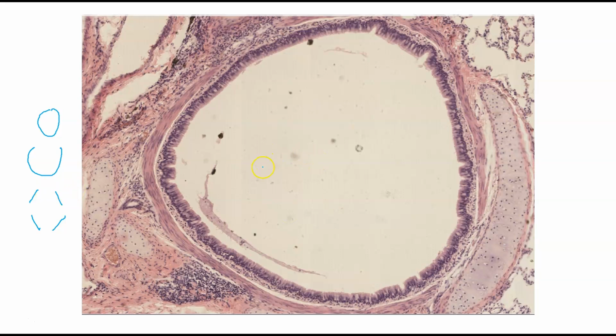And if you look at this picture, that is what is so hot about it. Around the bronchus here, we don't have a complete ring or a C. We've got these boop, boop, boop, kind of irregularly spaced cartilages. These are the irregular plates of cartilage that surround the bronchus. That's why it's so cool. Dude, you have no idea. I have yet to have found a picture that shows this awesome kind of irregularly spaced plates of cartilage, and here it is. So there it is.